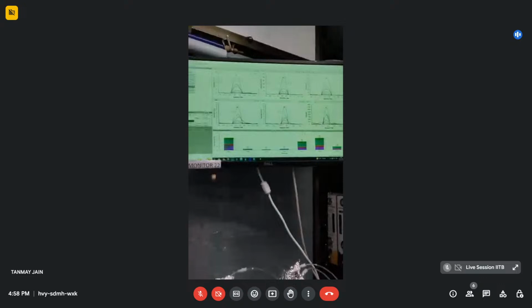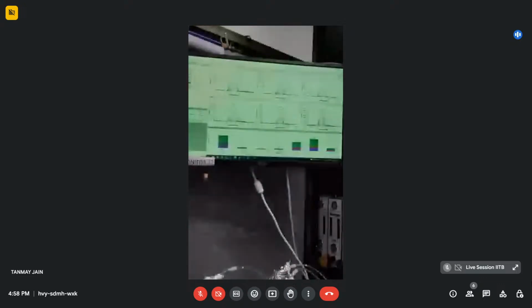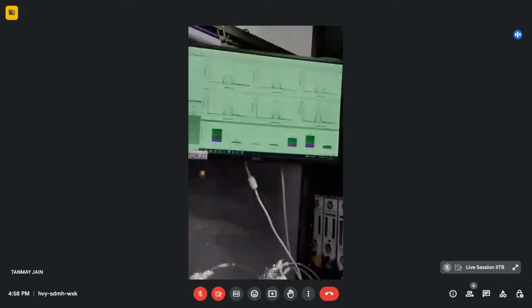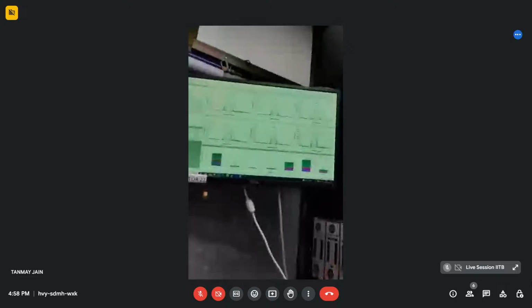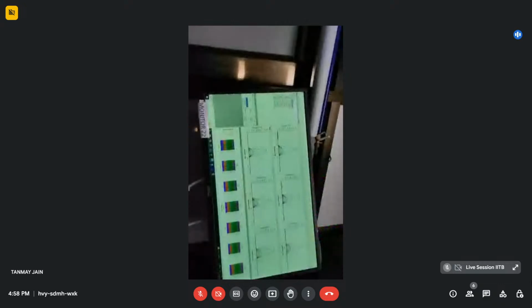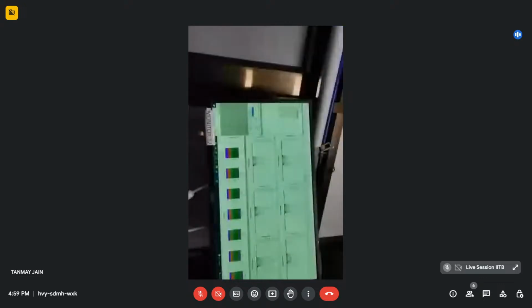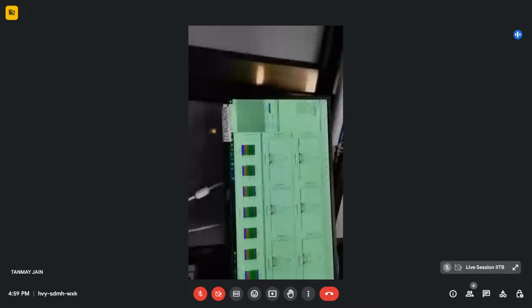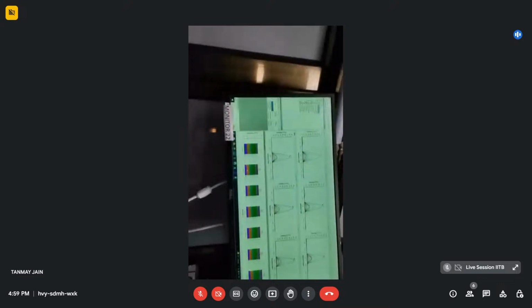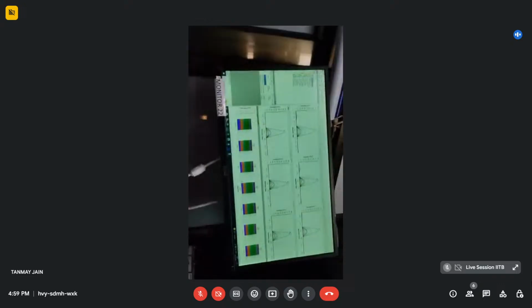So if the protein that you have already got is a lead from the shotgun proteomics, now to make sure of that, we first run synthetic peptides throughout the samples to make sure that there is no instrumental bias. Instrumental variability is nullified. So we run the synthetic peptide, and as you can see, the intensity of the synthetic peptide is very much uniform in all the samples, in the COVID positive and COVID negative.